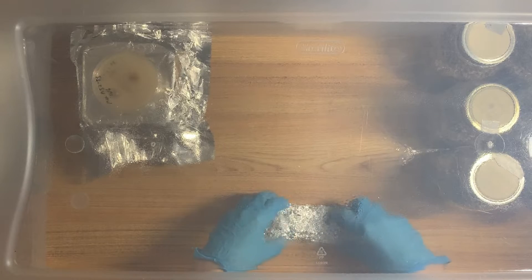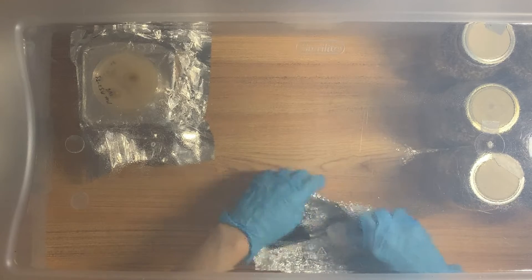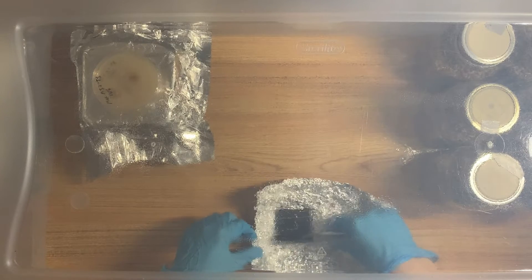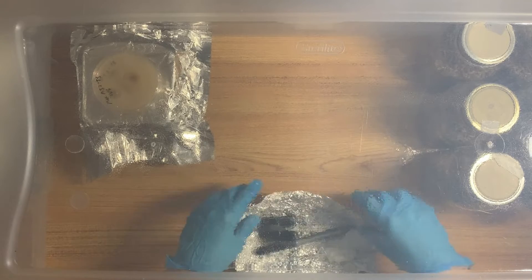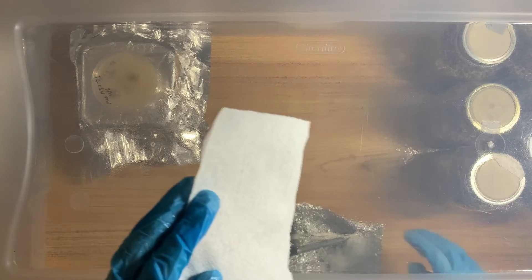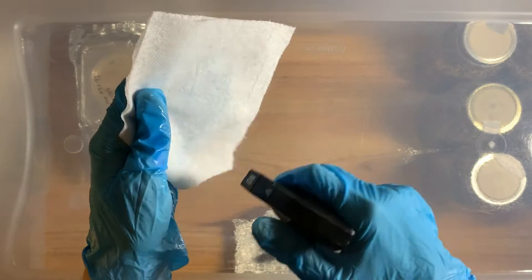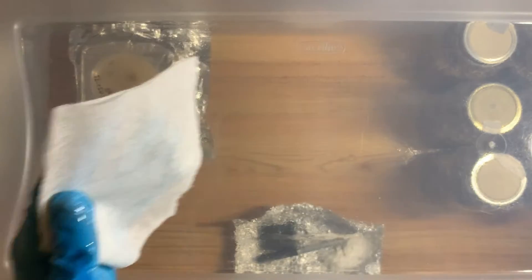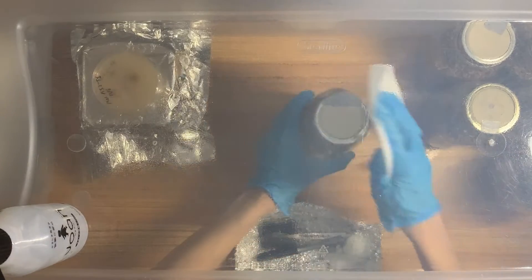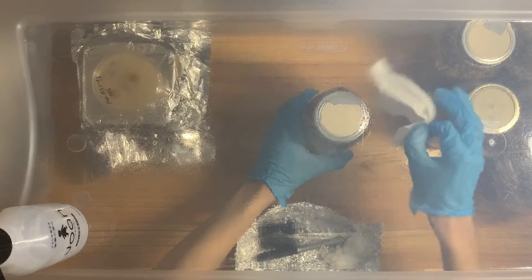In that little foil packet I've got my Sharpie, my scalpel and scalpel holder, and a paper towel soaked in alcohol that I used earlier to wipe down the tools — so they've already been alcohol-wiped. Now I'm going to make another alcohol-soaked paper towel. I'm going to use this one to wipe the lids and the agar plates before I use them, and the one already inside the packet I'll use to wipe down the scalpel in between touching agar.